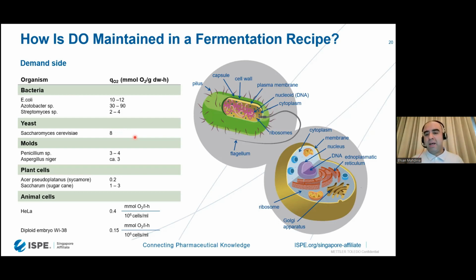So that more timed growth means that we have time to provide the oxygen for itself. And mold is even slower than yeast, so you can see the numbers come down when we are dealing with mold. And when we're dealing with cell culture, animal cells, look, the numbers are not even comparable to mold. Why? Not because, again, cell culture doesn't need oxygen as much.